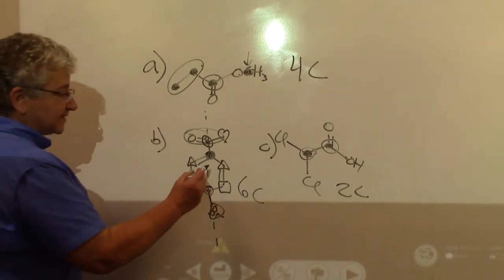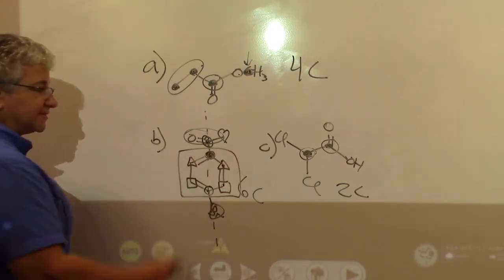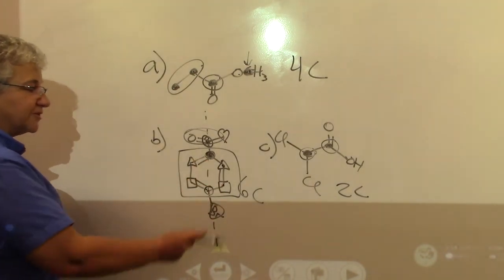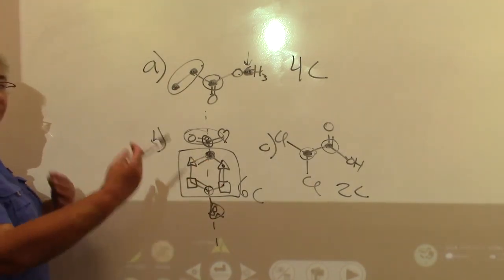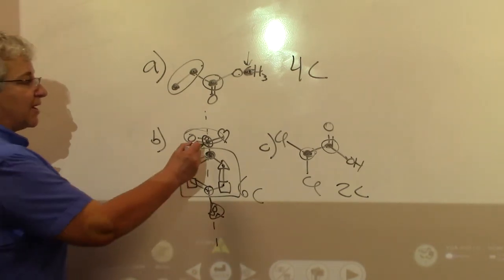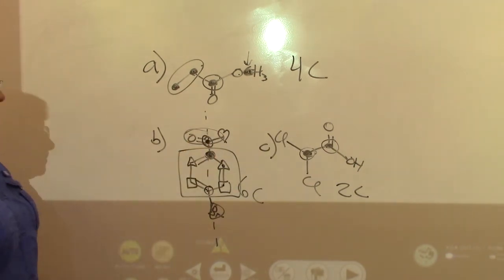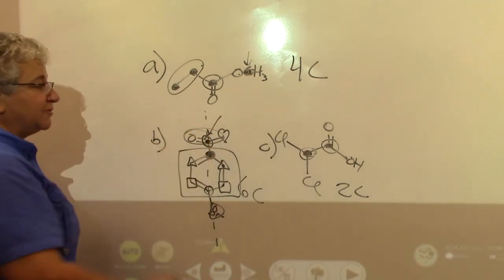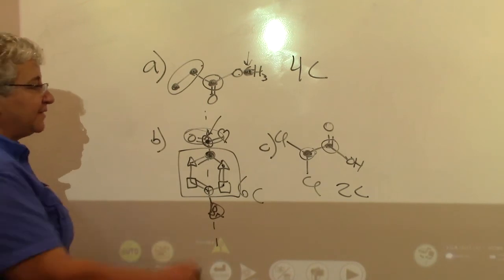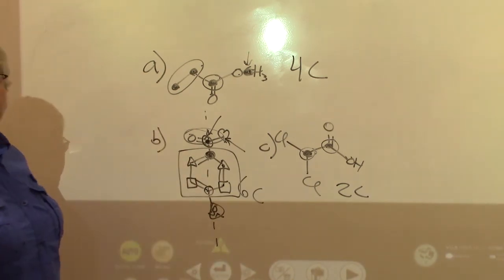In this case, I have 1, 2, 3, 4 aromatic carbons. So these 4 different carbons in here would be found in my 110 to 160 region. My carbonyl of a ketone, recognize that that's a ketone, so this carbon would be somewhere 200 or above. And then I'm left with the methyl group, and again, that methyl group is going to be the furthest one upfield.